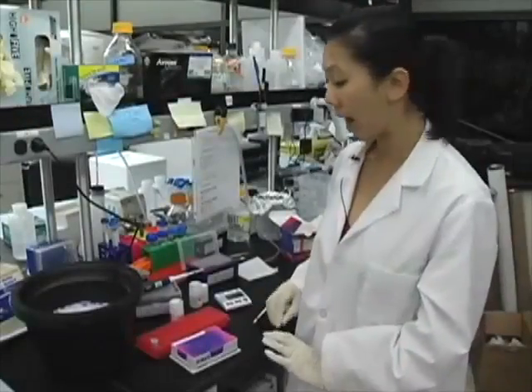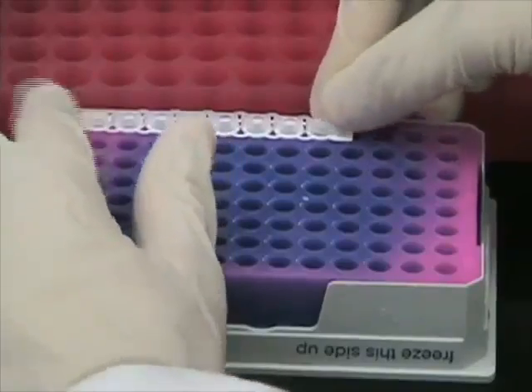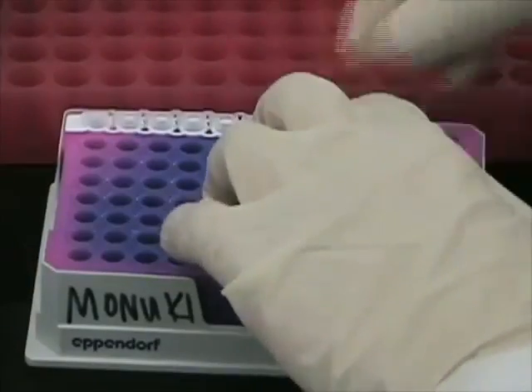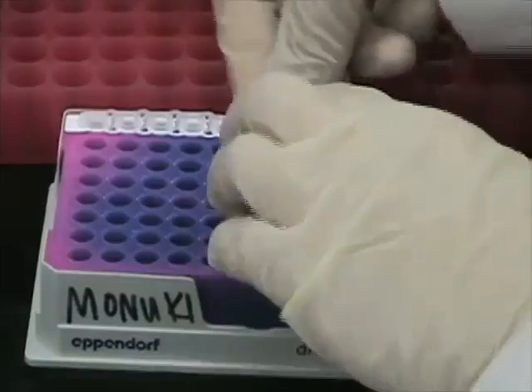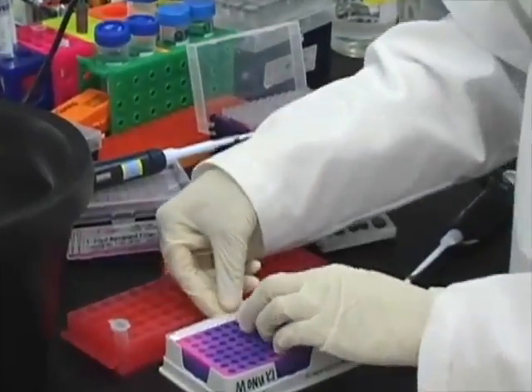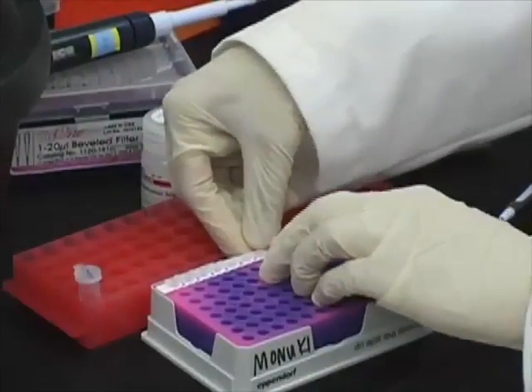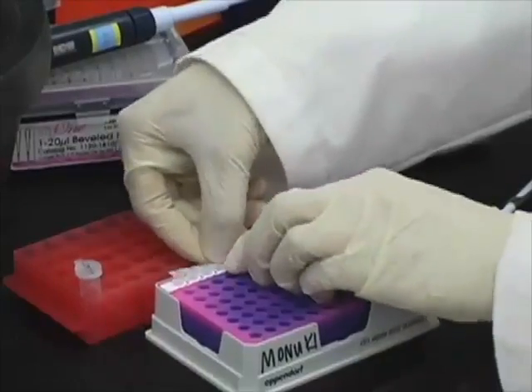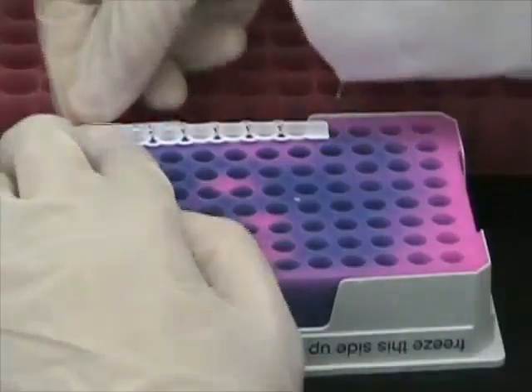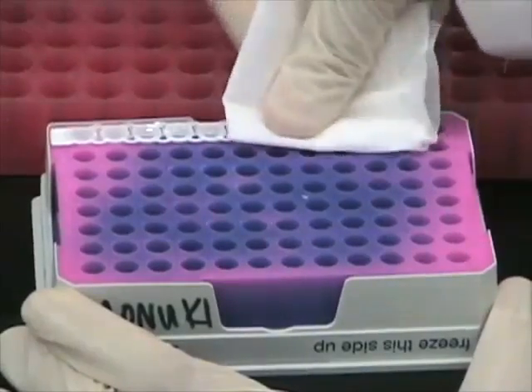Once they're all added, you can cap them with an optically clear 8-cap strip. You want to be careful to not touch the optically clear part of the caps that are over your samples. So I'm using a Kimwipe to push down on the caps to make sure that they're sealed.